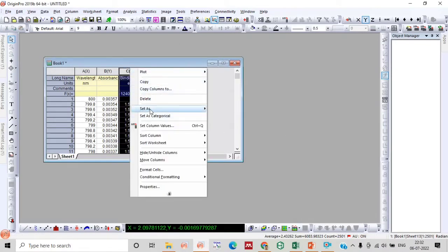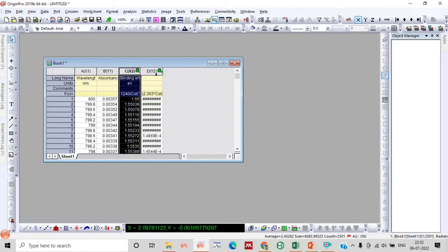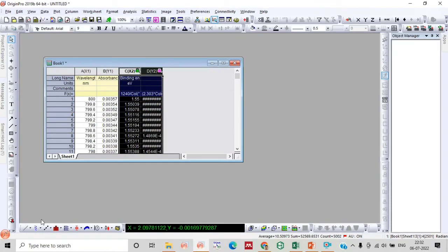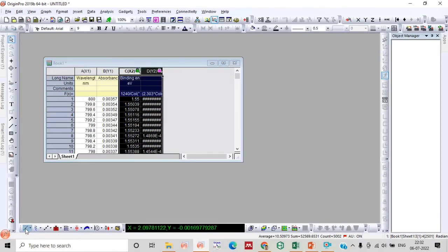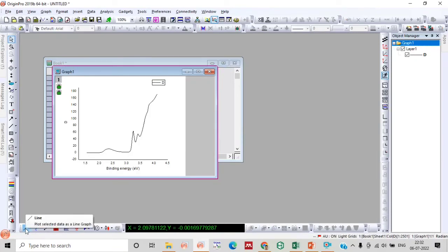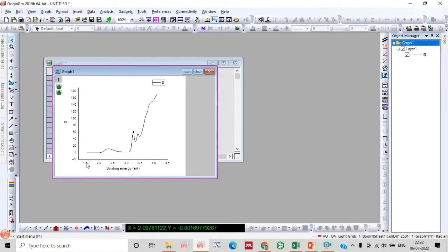Now select column C and set it as the x-axis. Now drag the C and D columns and you will obtain a Tauc plot. Now we need to rescale this to get a clear view of the Tauc plot.